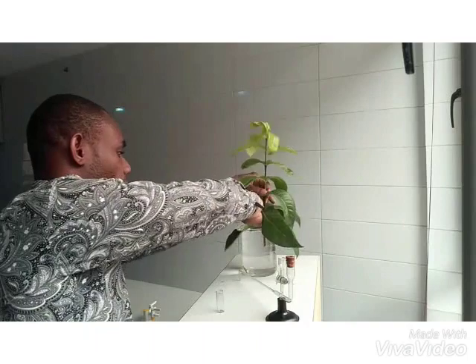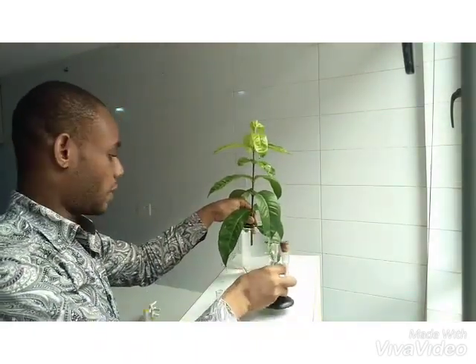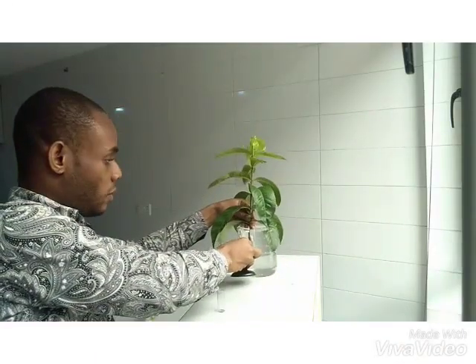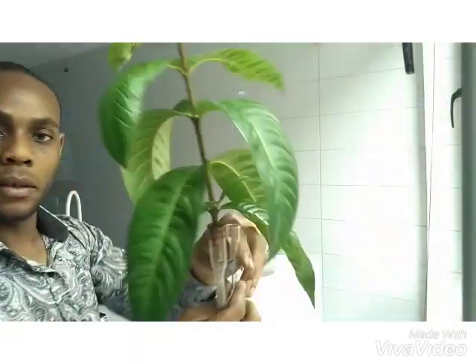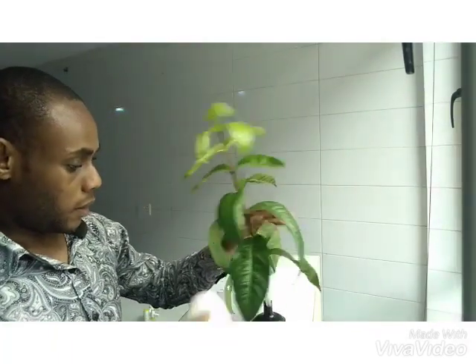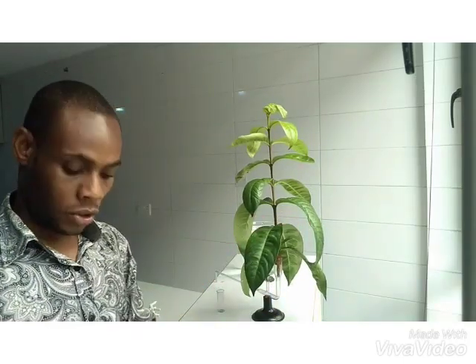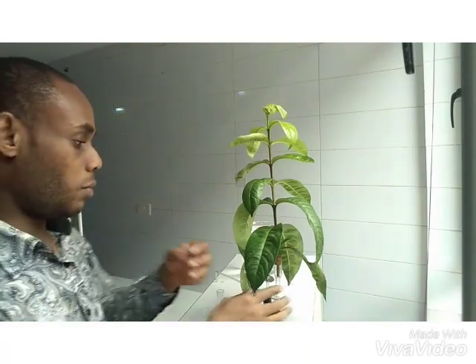The next thing I want to do is to transfer this plant to the potometer. So I quickly transfer it from the water to the potometer. Now I fit it to the potometer. Our plant is fitted to the potometer, tightly fitted in such a way that air doesn't pass through to affect the water that will be inside the potometer.